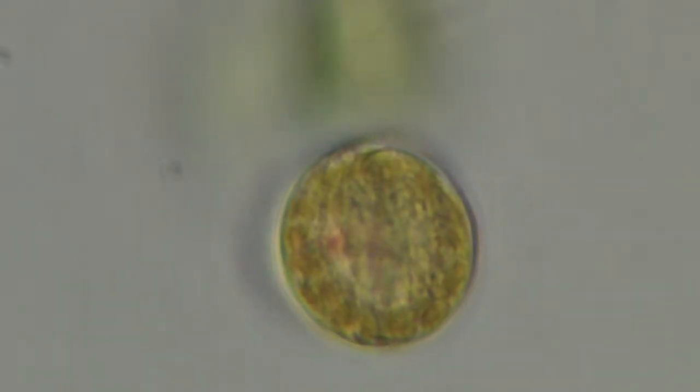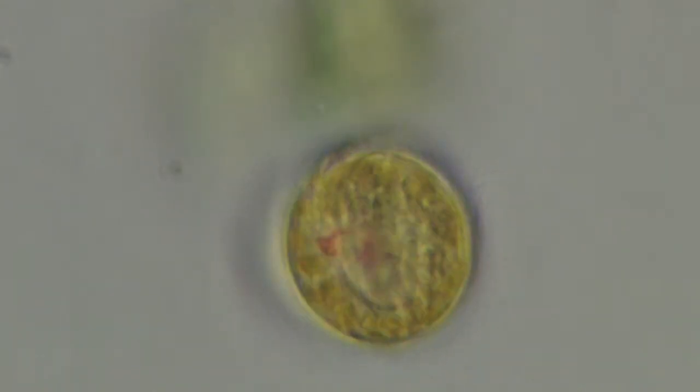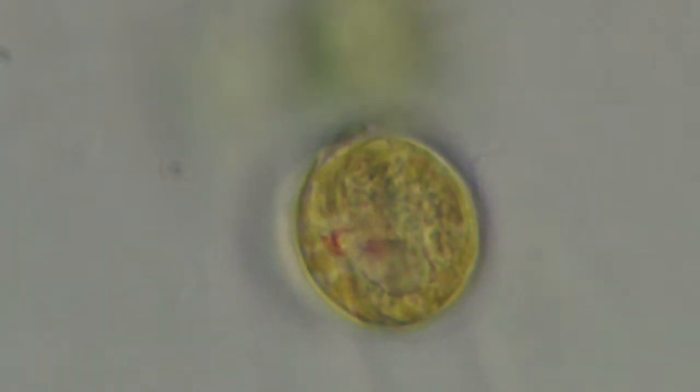So I'm seeing a flagellum off to the right, and then there's this kind of wavy, fuzzy thing on the upper margin. You can probably see it there pulsating. That's another flagellum coming out of that groove. So it allows them to basically tumble. Unlike Euglena, they have this kind of whipping motion, making them move a little bit like a nematode. These guys can rotate, like when you throw a ball, it rotates in space, and spin with the flagella on different axes. Pretty cool.